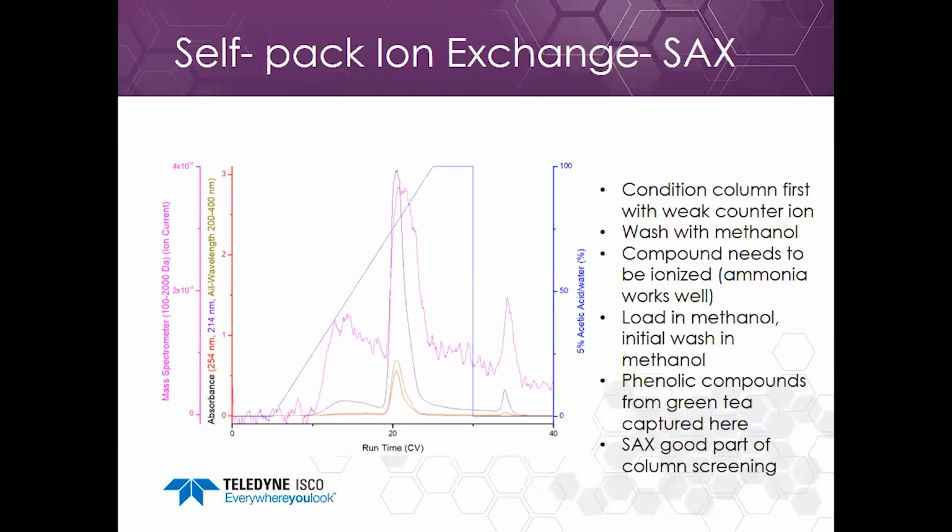The compounds that were captured from the ion exchange were greatly enriched because I removed the neutral and basic compounds, and in fact, it is almost ready for prep LC. And I used about half a gram of crude extract on a 15-gram strong anion exchange column with liquid loading.